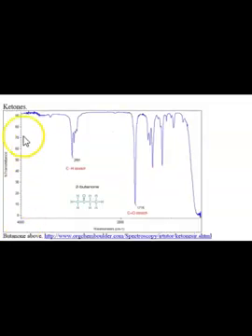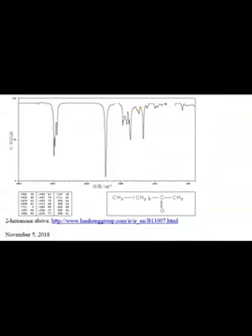Just one last look at a ketone. Very simple, but you'll see that all of those CH bonds here show up in this region, and then your characteristic carbonyl group there, again at 1715. So a very simple molecule for what we're dealing with. And then if we wanted to, we could look a little bit closer at this one, and that would be hexanone. And so it's not much different. It's still a very simple molecule here. And so maybe here we would see differences in the characteristics.